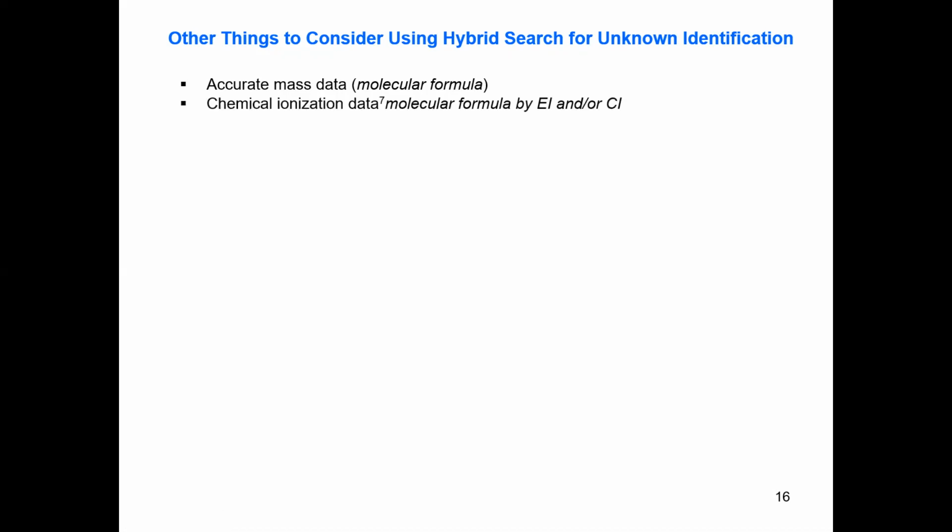Chemical ionization: there's an article on my webpage that talks a lot about it. It's a good book referenced in there. Make sure you know how to do it, and you'll very much appreciate it when you're doing just general work, not even hybrid, because it's so powerful to know the molecular weight of something with accuracy.